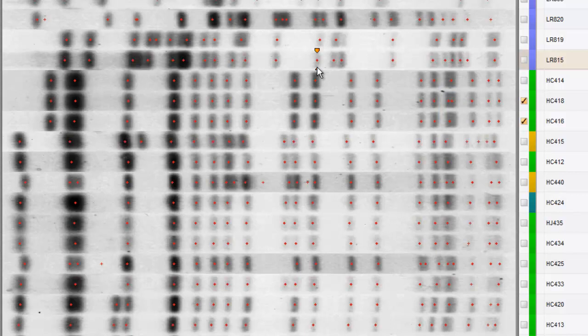Note that I can hide or display the band marks using the F2 key, which can be useful to examine the patterns.